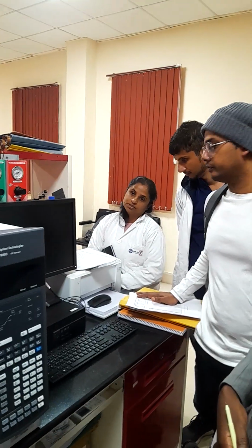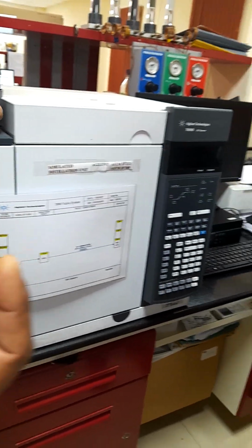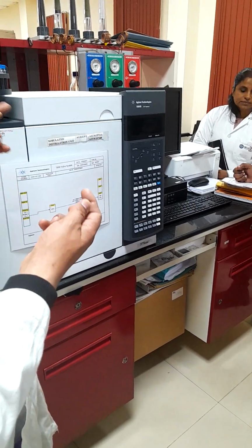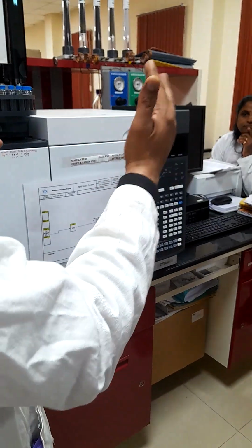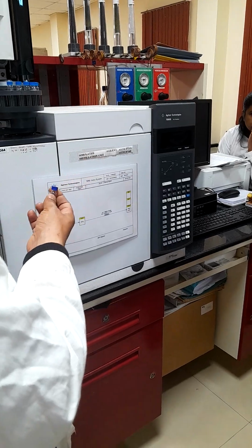You have this in this vial. How many volumes do you take to dilute? What's the dilution? I'm coming to that. The concentration is not known to you. Either it is dilute or viscous, how much viscous. So you will prepare a 1 to 2% solution of this hydrocarbon with the help of CS2. You run CS2 as a blank also. Whenever you run CS2 as a blank, all the previous signals nullify and you get a blank baseline. After that baseline, with the help of this calibration data, you run the diluted sample also.